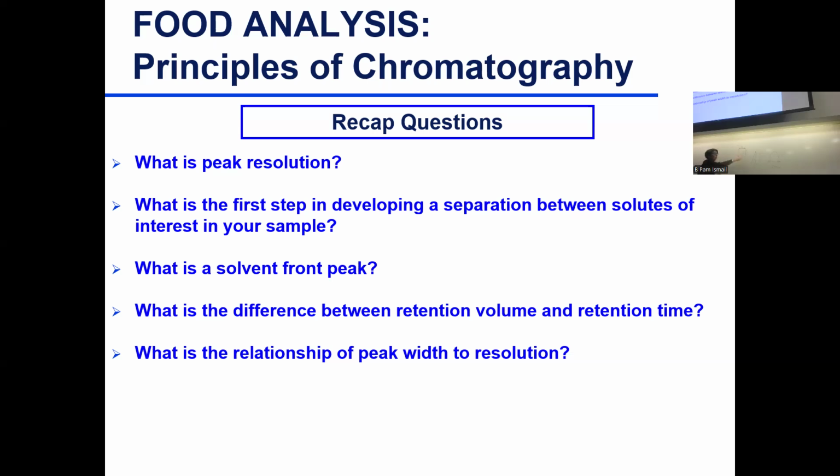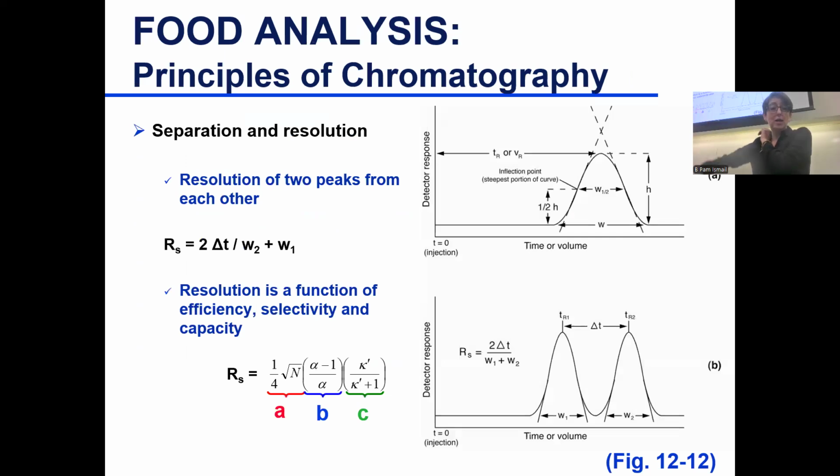If they don't reach equilibrium fast and they are diffusing within the stationary phase, they kind of spread, and take longer time to come out of them. Right, so this is important for us to continue our conversation, which leads me to this resolution of two peaks.